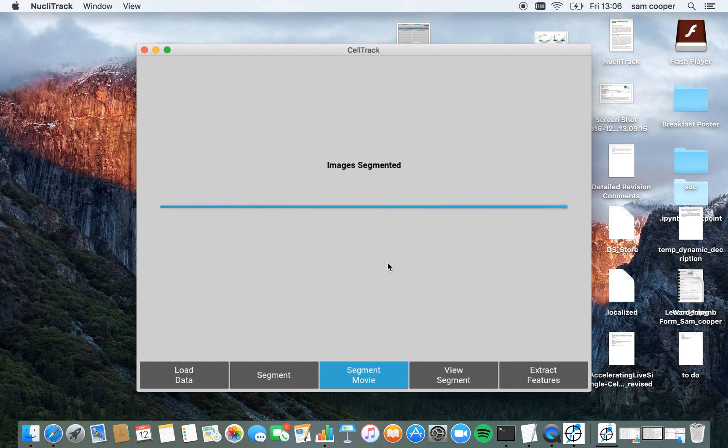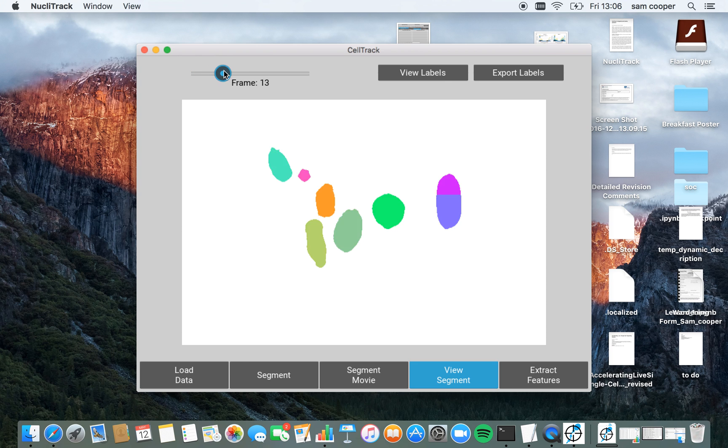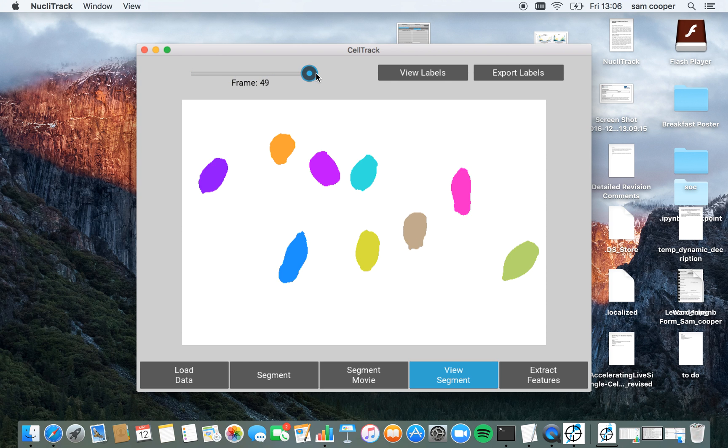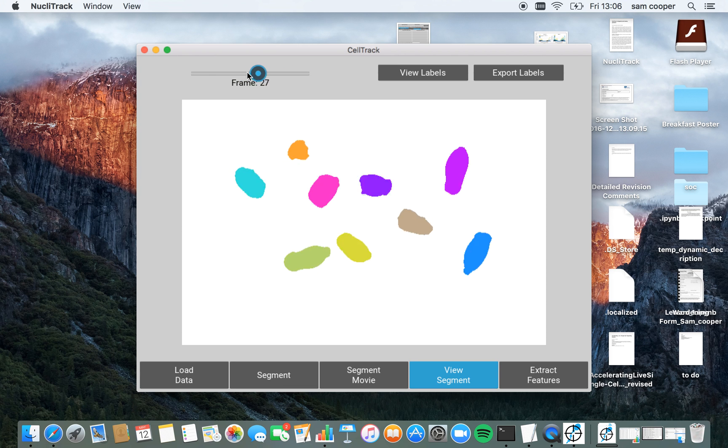Now that the images are segmented, I can progress to see whether I'm happy with the segmentation results. Looking at this set of images, NucliTrack has picked up all of these cell segments as well, and I'm happy with the results.